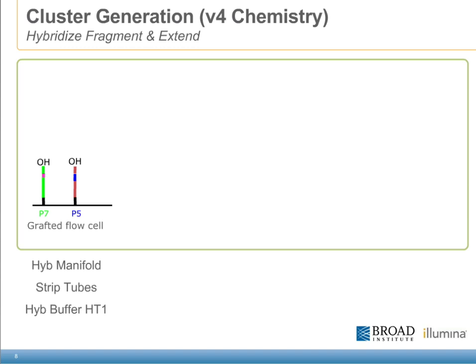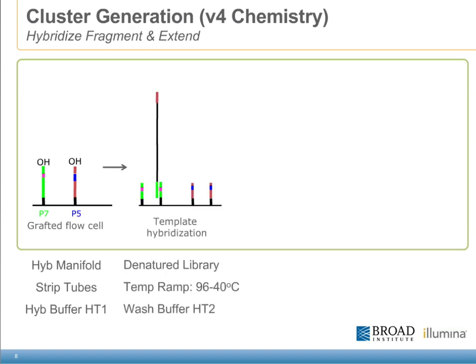We start off with the paired-end flow cell. The surface of the flow cell shows the P7 and P5 surface-bound oligos. We need the Illumina hyb manifold, which allows us to take material from strip tubes and transfer it into the flow cell. The strip tubes contain our samples of interest, some buffers, and our hyb buffer — a basic salt storage buffer we'll use to prime the flow cell for the addition of residual reagents.